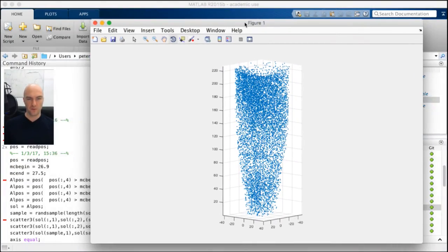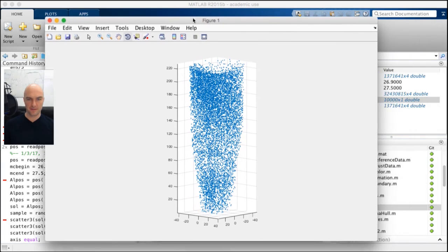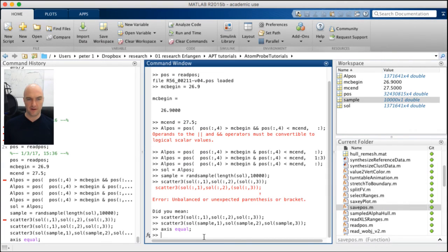And now if we want to actually animate that, that's very simple. All we need to do is type in animate, not isosurface, we can animate isosurface as well. Oh, what did I call the program? Turntable animation. Sorry, turntable animation. So this means how many steps. So the step is 0.5 degrees.